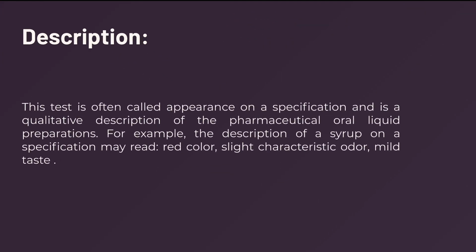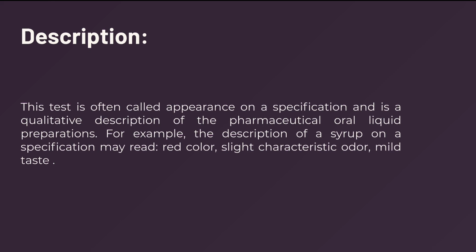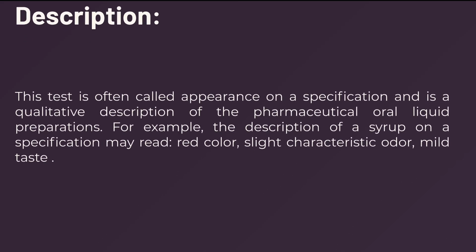First, description. This test is often called appearance on a specification and is a qualitative description of the pharmaceutical oral liquid preparations. For example, the description of a syrup on a specification may read: red color, slight characteristic odor, mild taste.